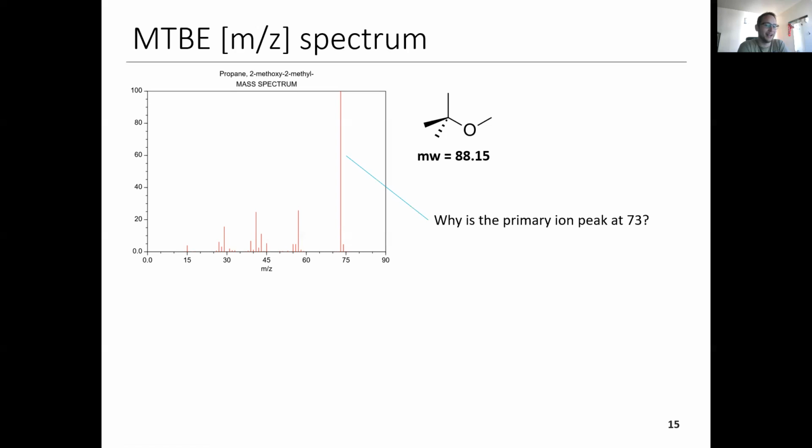It's EI, right? Which stands for what? Electron ionization, right? And so what's special about that particular kind of ionization? Is it hard or soft? I think it's hard. Right, okay. So those electrons have enough energy, like I talked about, to potentially break some bonds depending on the nature of the chemicals that are being passed through the beam there.